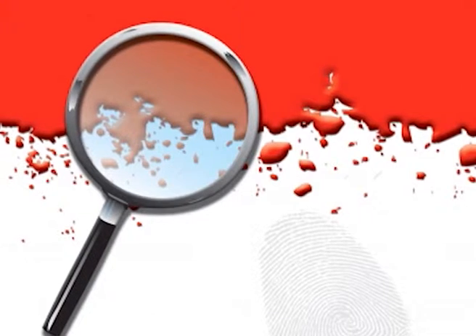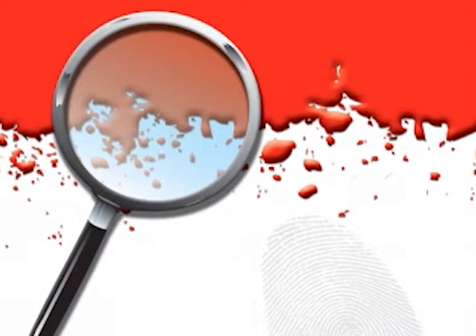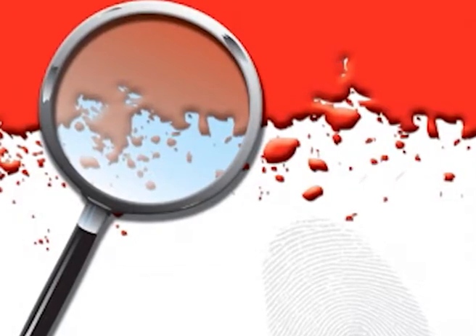So, dear students, let us start with the introduction of this lecture to detection of blood prints. Latent prints are mostly encountered at the scene of crime. The investigators use the general technique of oblique lighting to locate these latent finger marks. After locating these prints, certain physical and chemical techniques are required for the development. The physical techniques generally include the powder method, whereas the chemical techniques include the application of certain chemicals such as ninhydrin, iodine, cyanoacrylate fuming, etc.